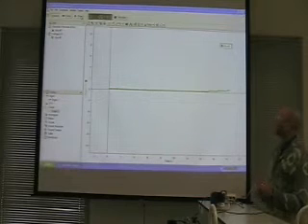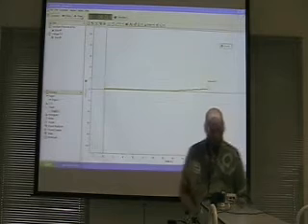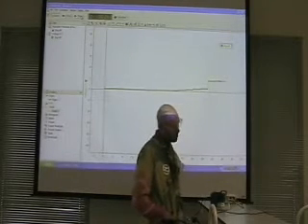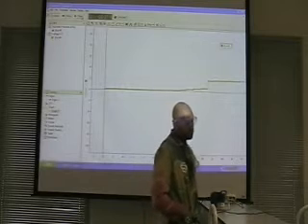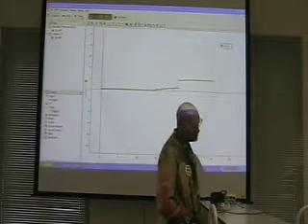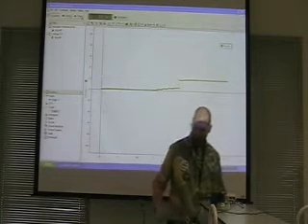It's going to surge, it's changing. Oh wow, it's changing. It's taking them about once a second. And it looks like we're about as dark as we're going to go, right?